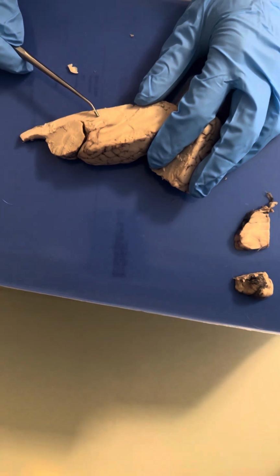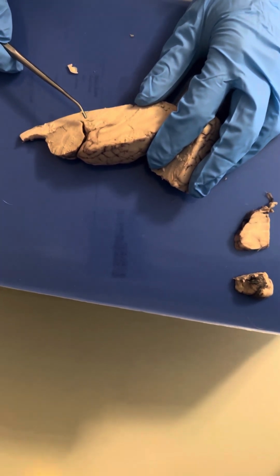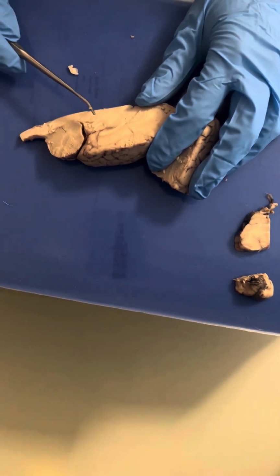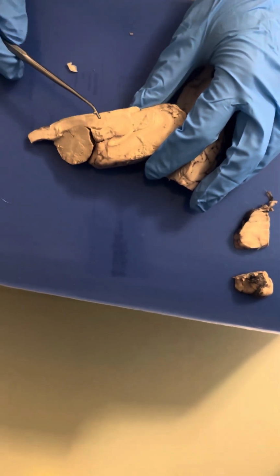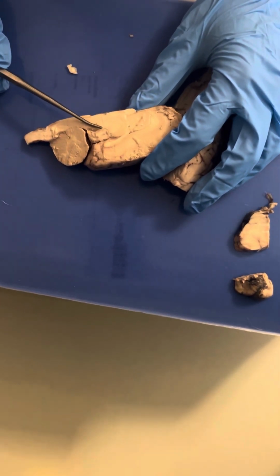Lastly is the hypophysis, which should be somewhere in here. It's really hard. My brain's kind of squished. And that is also known as the pituitary gland, which controls the endocrine glands.